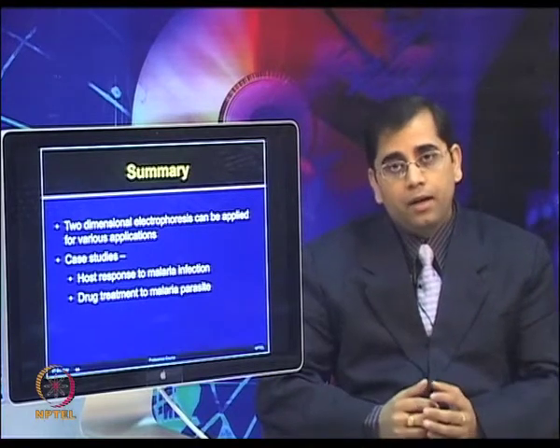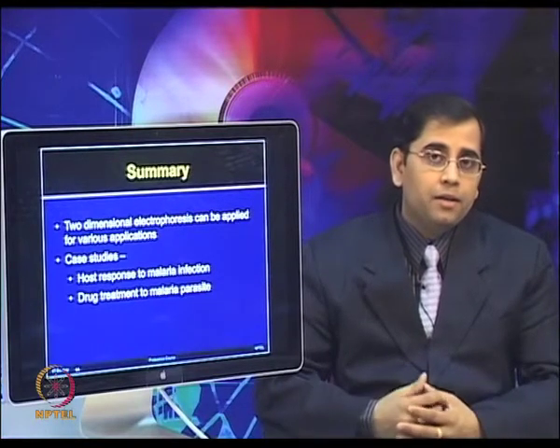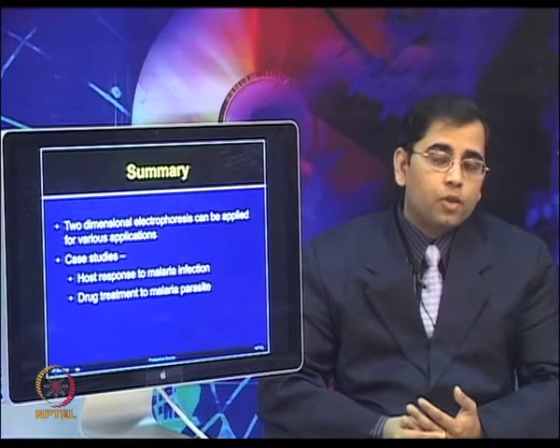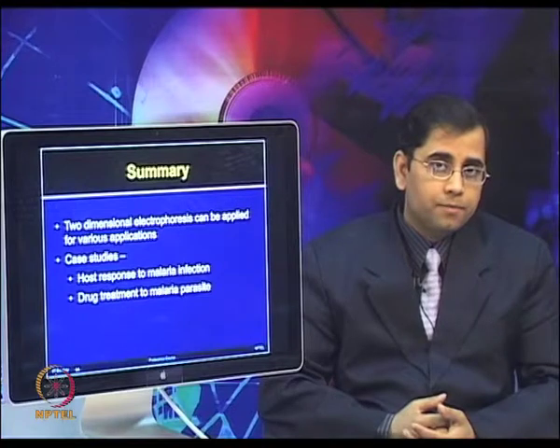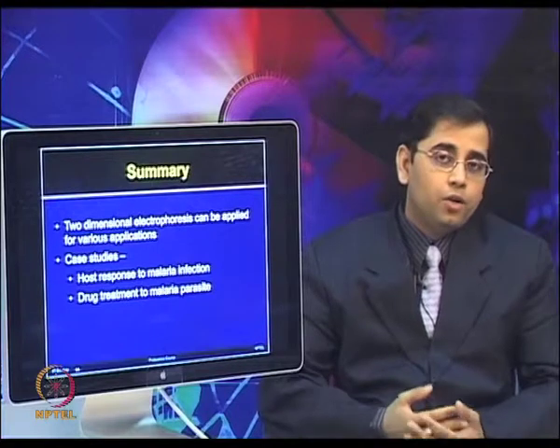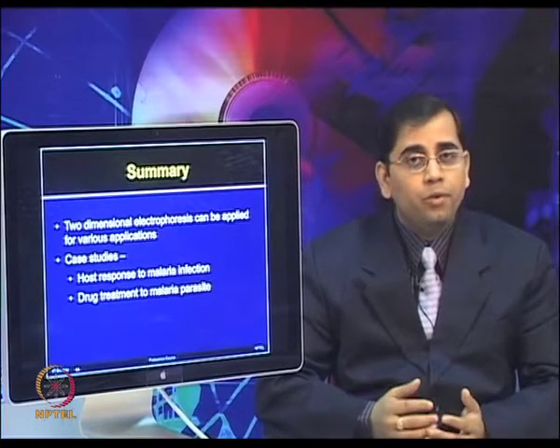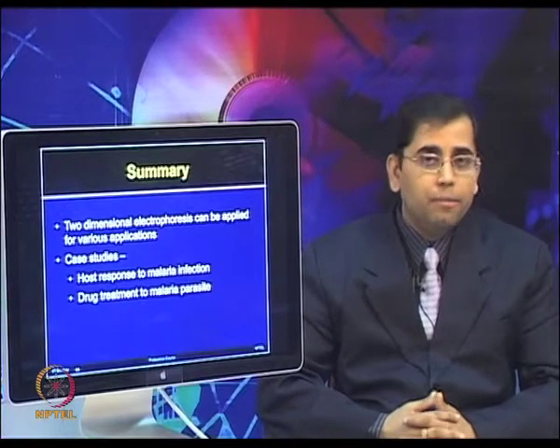If you can increase the overall proteome coverage, you can separate over 1500 to 2000 proteins on the gel reproducibly, then you have a good chance of identifying various potential targets, which could be novel drug targets or potential biomarkers. But if you have not done the proper quality control experiment, you have not optimized the protocols properly and your proteome coverage is very poor on the gel, then you are comparing only a partial proteome, and there is a good likelihood that you will miss many important changes.